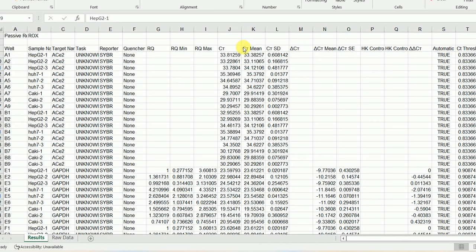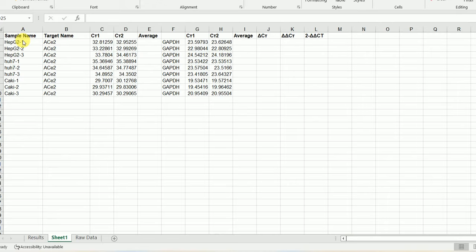What I'm going to do now is copy this column, this column, and this column and put them into a new sheet. Now I have arranged all the sample names and also the target names, everything in this format in Excel.